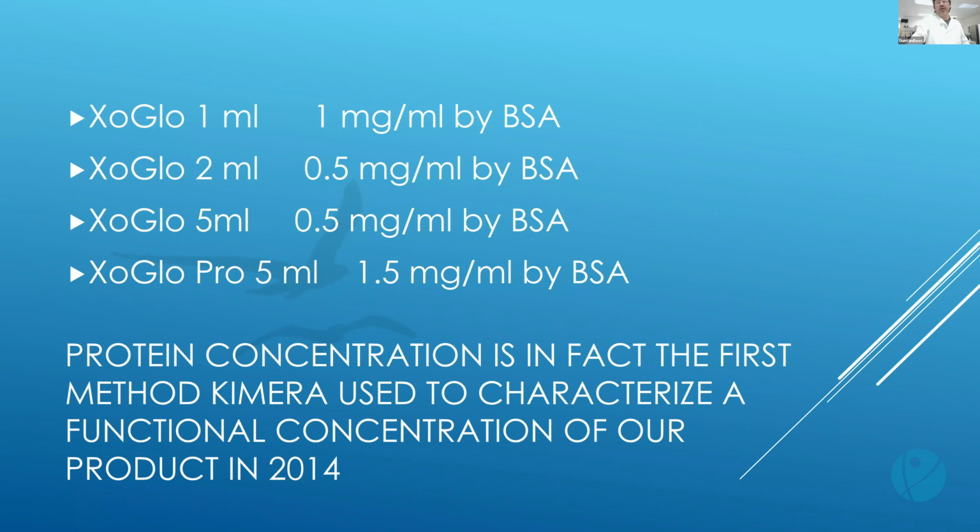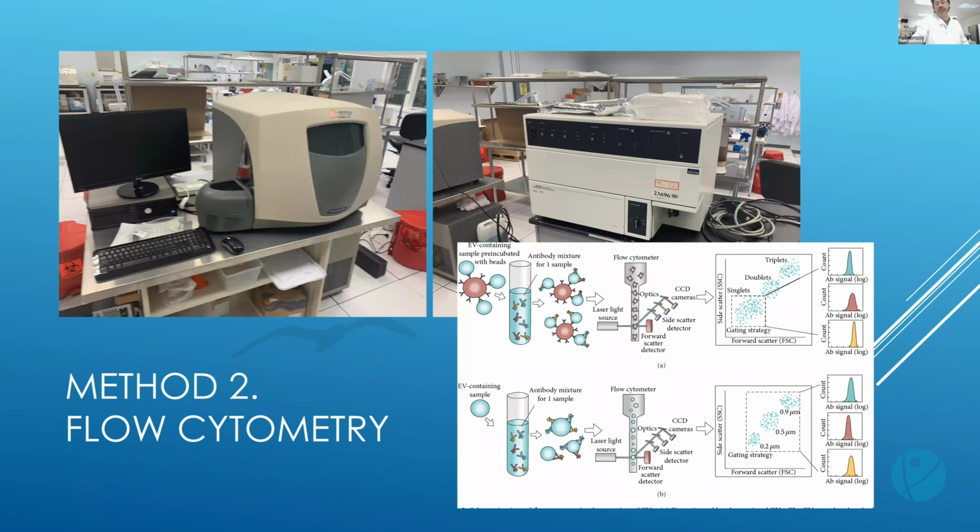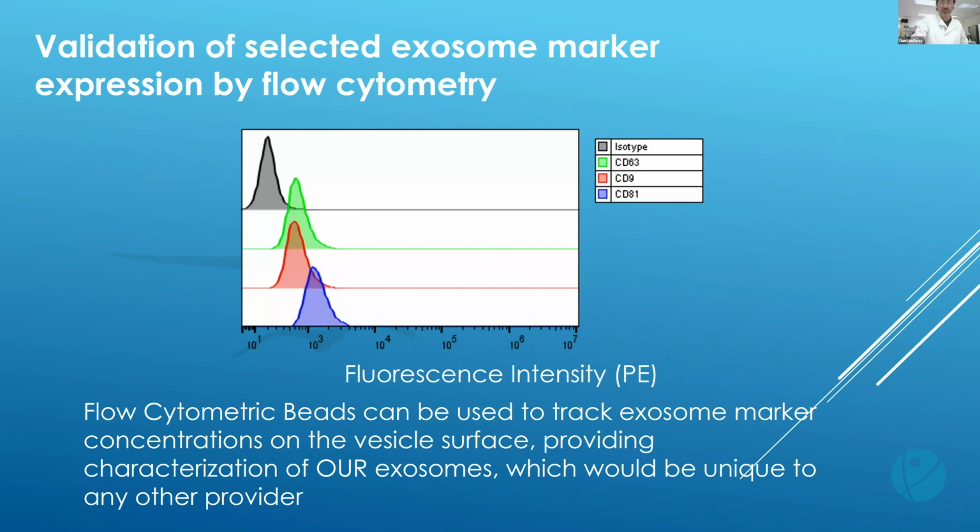You can look at the surface of exosomes using flow cytometry, but you can't look at individual exosomes. It's kind of hard. These beads will grab a number of exosomes at the same time and try to increase the signal. It's okay. It's data, and that's what that data looks like. So I know I have exosomes because I have CD63, CD9, and CD81 on their surface. Now, not every exosome has each one of those markers, and that's where exosome science is right now. That's the state of the art.